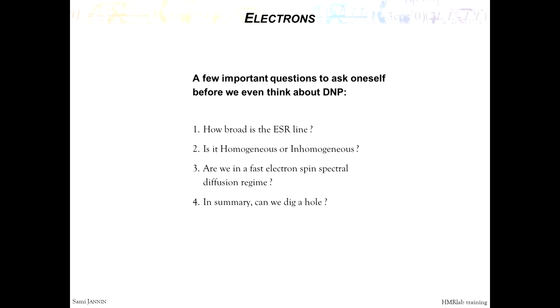Because there's a huge helium bath, and a sample that has some boundaries, there is a resistance for the heat to go out, which is quite high at low temperature. There's this Kapitza resistance, so we can make some calculation. I don't think I showed the calculation, but I've done that in the past, and it shows that the sample heats quite substantially. And it's most probably, as you say, a limiting factor.